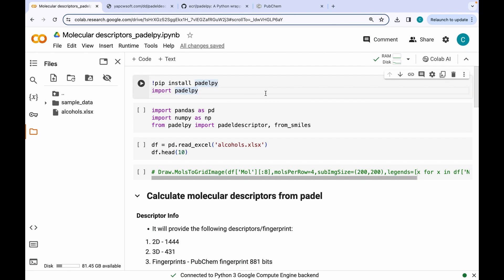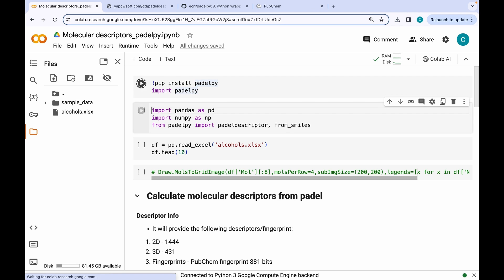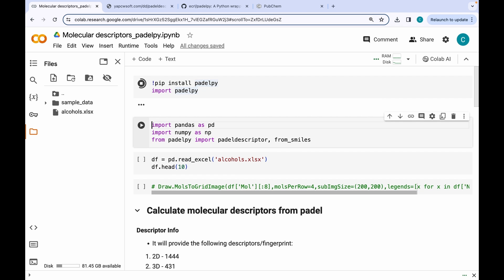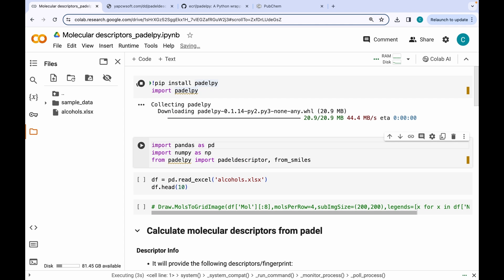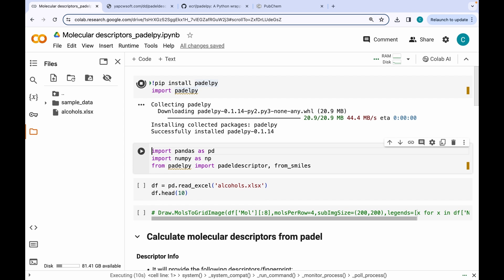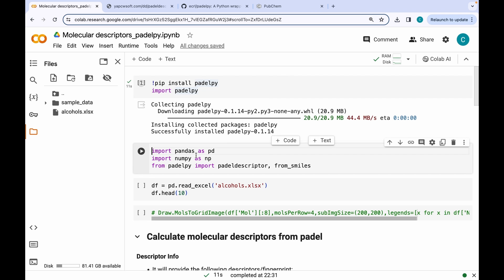The first step is installing and importing PaDEL-py. After it has been successfully installed, I am going to be importing Pandas and NumPy, which will help us in data manipulation. Along with that, I am importing the PaDEL descriptor and FromSmiles functions from PaDEL-py.